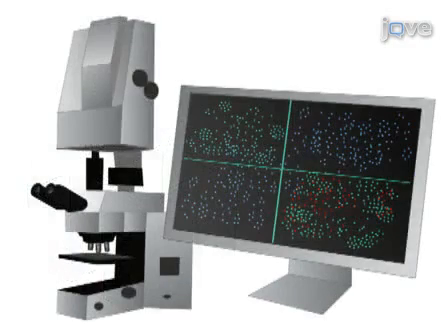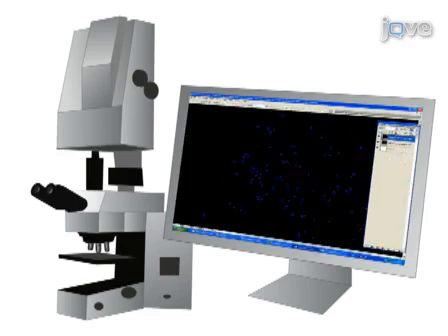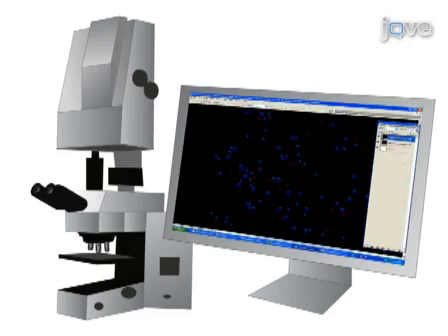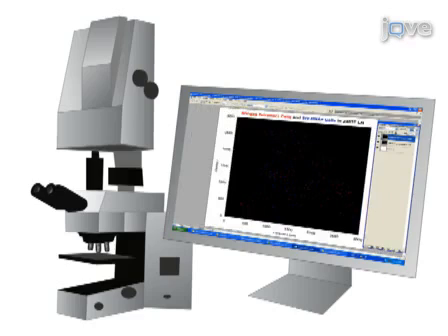Confocal microscopy is used to image the double-stained sections and ultimately reconstruct the original thick sections to reveal the relationship between immune effector and target cells. Using this procedure for examining early SIV infection has proved to be a good predictor for the severity of the ensuing disease.